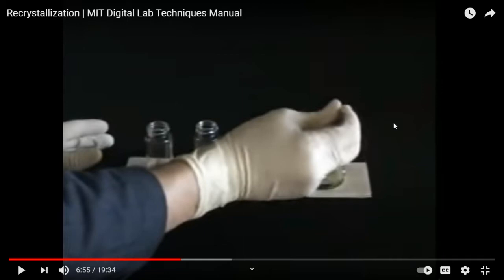So you add just a bit, although you may lose a little bit of the main compound. In return, you get more pure compound. But make sure you do this quickly because the solution is getting chilled, okay? You don't want that. You want it to be hot. Then you have to move quickly. It's very delicate. Not too hot, not too cold, and quick enough. Not too much, not too little.